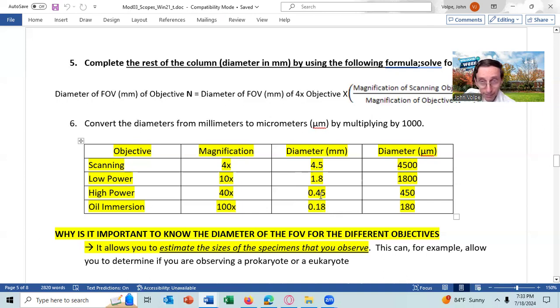But the point is, these two, the students often get wrong because the smallest unit they have on the ruler is 1 millimeter. And so they have to estimate this size, and especially estimate this size. Any question about that? And for the online class, we just fill it in for you. And you do need to know this table for answering some of the questions in today's lab.